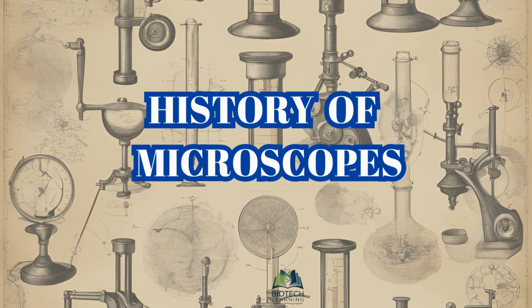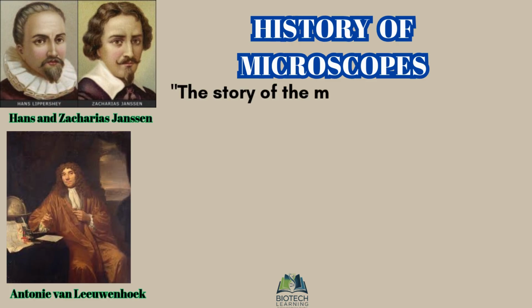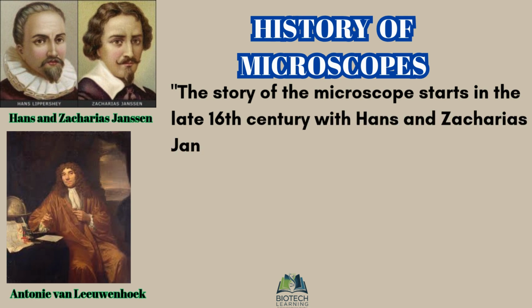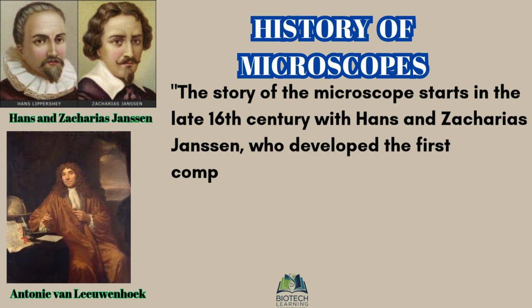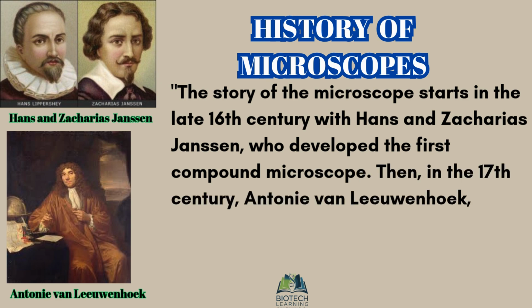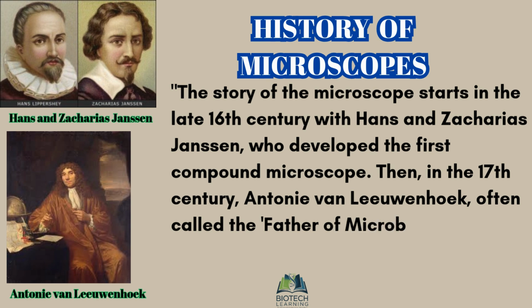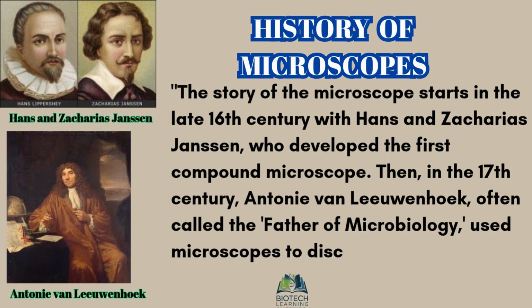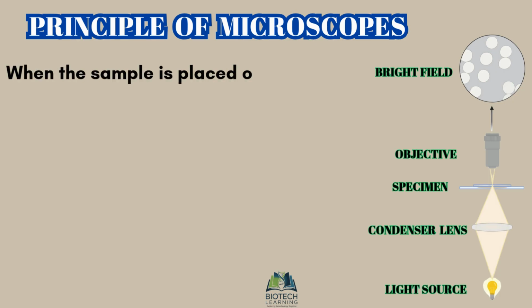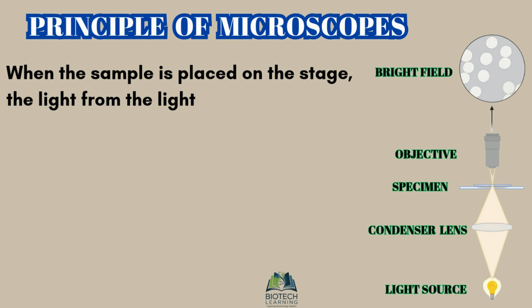History of microscopes. The story of the microscope starts in the late 16th century with Hans and Zacharias Janssen, who developed the first compound microscope. Then, in the 17th century, Antony van Leeuwenhoek, often called the father of microbiology, used microscopes to discover bacteria and protozoa.